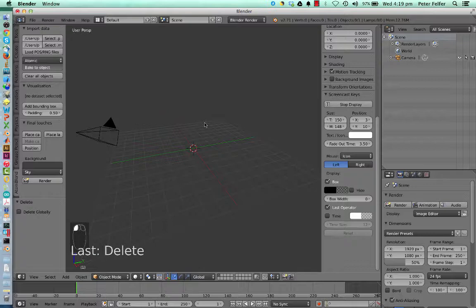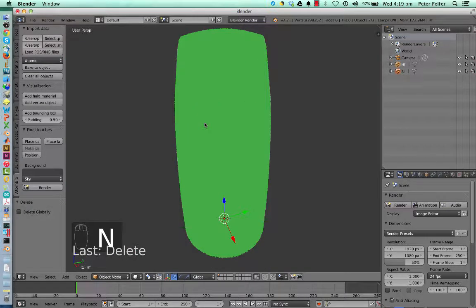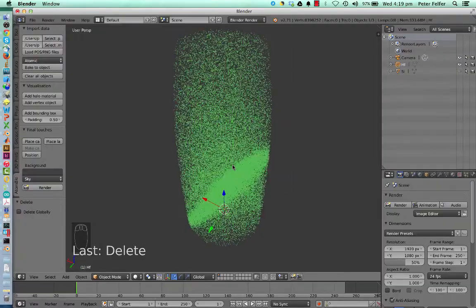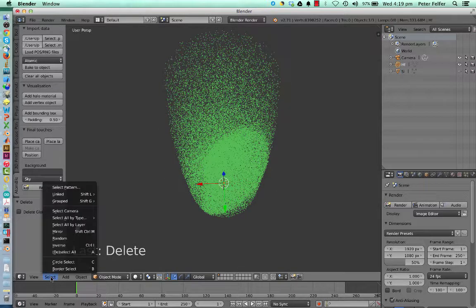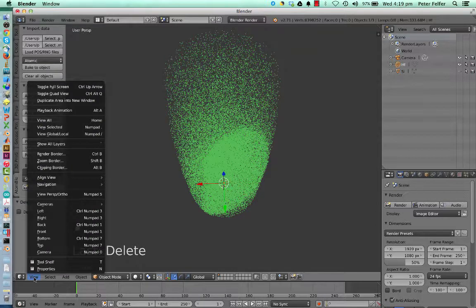This is about 10 million atoms in total, and you can see it's still fairly zippy. Switch off the silicon, because that's not going to make too much of a difference. Maybe actually what we might do is make a cross-section like the one that I showed you earlier. So this way you'll see the merit of this sort of visualization, really.